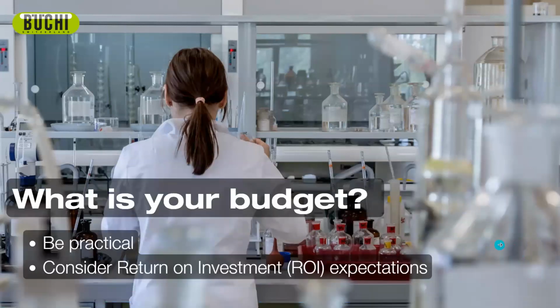We're also gonna look at your budget. Of course, it would be awesome to have all the toys, right? Have every protein determination option right there at your fingertips, but that's probably not in the cards for most businesses. So we really need to look at a return on investment for each technology based on the unique circumstances of your business. So that's something people like Jerry and Ryan can really help you work through. And it's hard to give a general rule of thumb here because, again, there's so many factors at play, so they would work with you to identify all of the things that would play into that ROI.